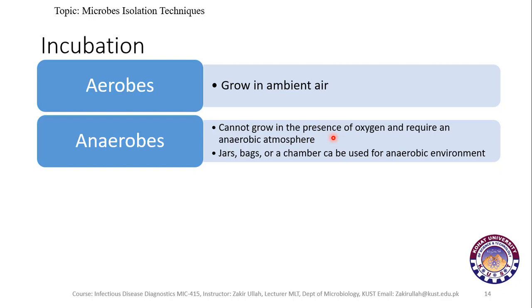oxygen. So they require an anaerobic atmosphere, and this atmosphere is prepared by using anaerobic jars, bags, or an anaerobic chamber to give such an environment to the anaerobes.